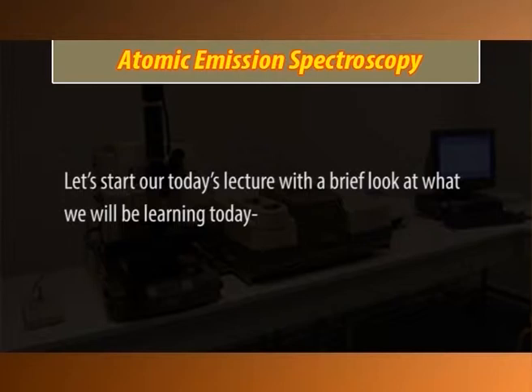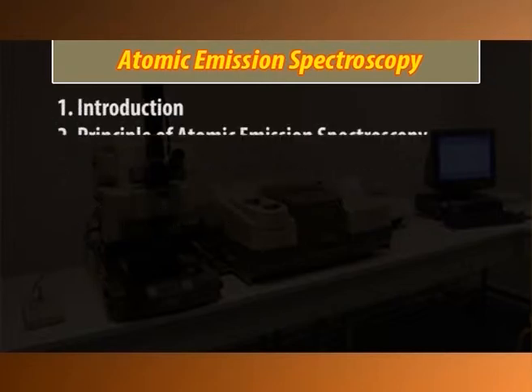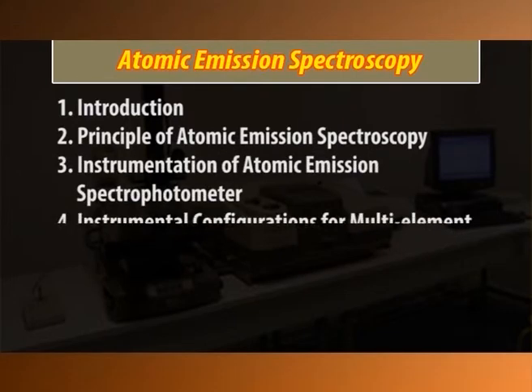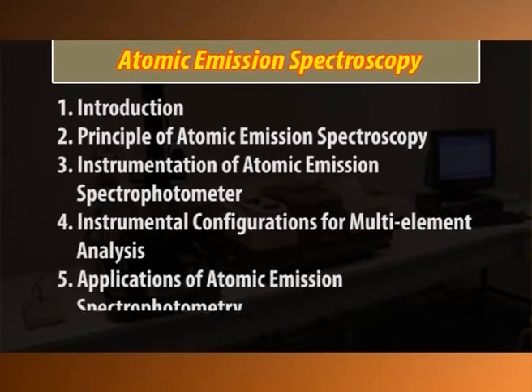In module 1, we will be talking about the introduction, followed by the principle of atomic emission spectroscopy, instrumentation of atomic emission spectrophotometer, and module 4 with the instrumental configurations for the multi-element analysis, applications of atomic emission spectrophotometry, and finally the conclusion.